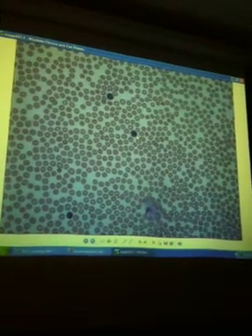A monocyte, it's really going to look like a kidney bean or a pinto bean got stuck inside of this cell, and it would be significantly larger. It would be much closer in size to these cells up here. Okay? Monocytes, even though they're fairly common, they can represent up to 4% of somebody's, maybe no more than that, maybe up to 8%. I can never remember my percentages anymore.